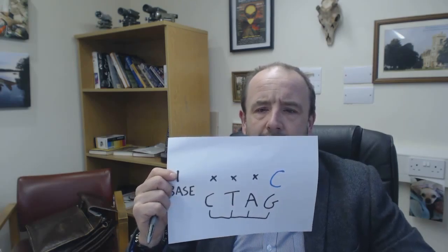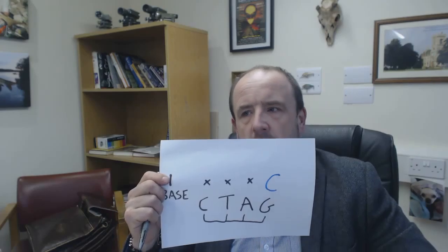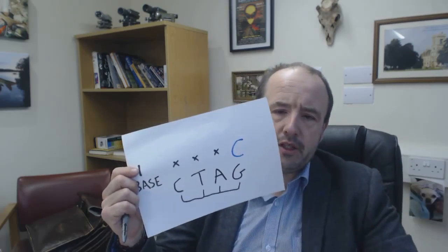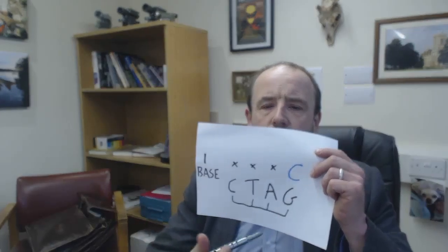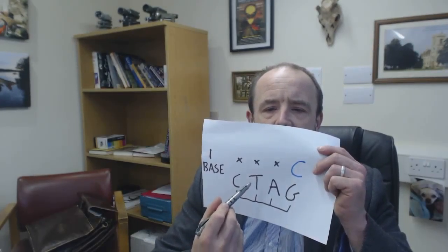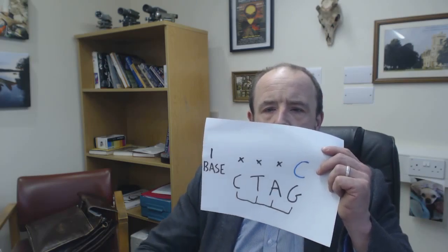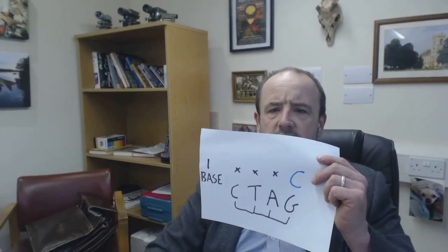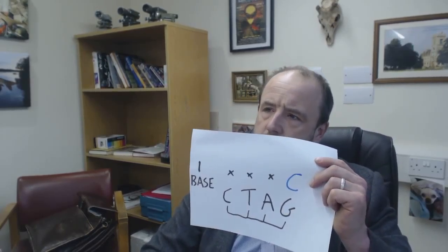The other fundamental principle of DNA sequencing, we have to imagine in the sequencing reaction, we're working with a PCR product, so there will be well over 1 million copies of our gene. Let's say we want to read this sequence. We want to decipher the sequence C, T, A, G. Okay, C, T, A, G. And that's what we sent away to the sequencing company to be deciphered.